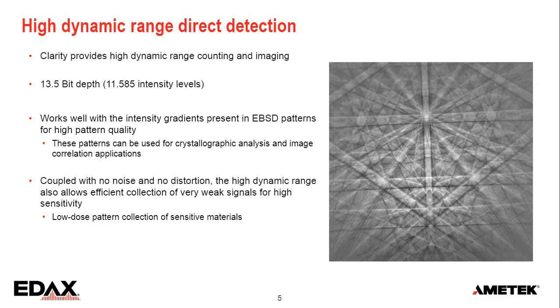But it's a bit less than here, and a bit of a problem is the noise that is generated in the phosphor screen. So you can get similar numbers of gray levels that we can measure, a bit less. I said 12-bit maximum, but it will never be as sharp as those.